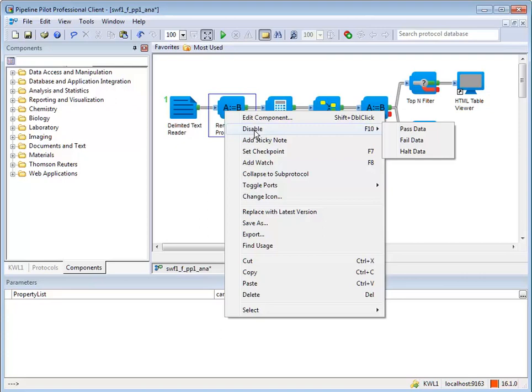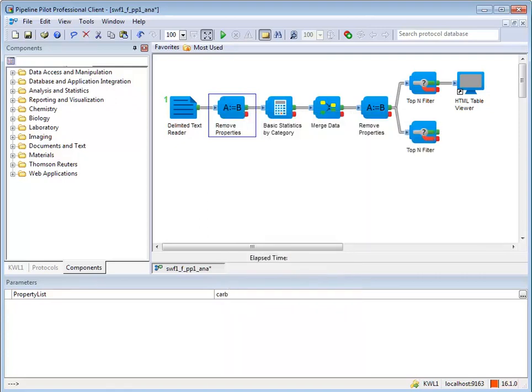You can also select a component, then press F10 on your keyboard to toggle through the options. We'll use F10 to show the different disabled states and review what each does.